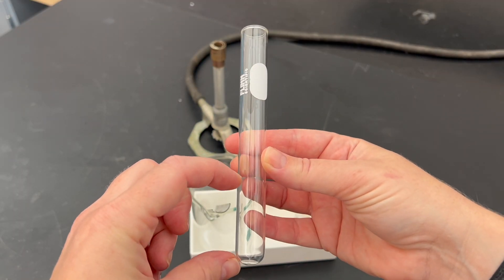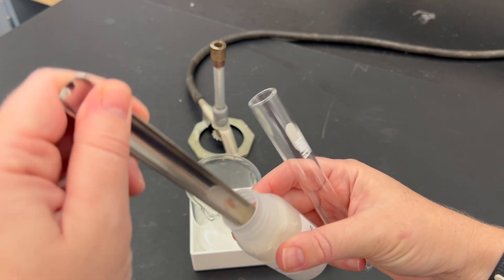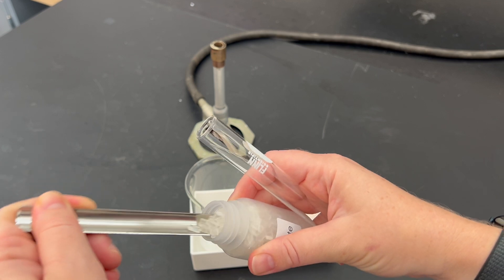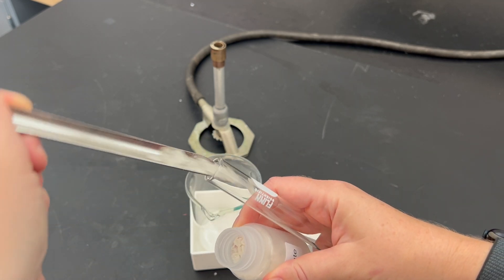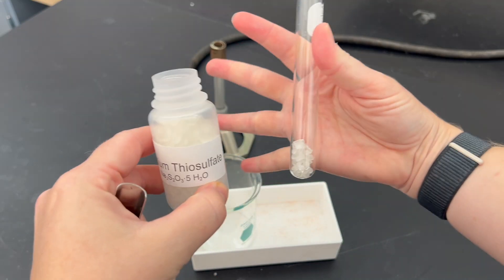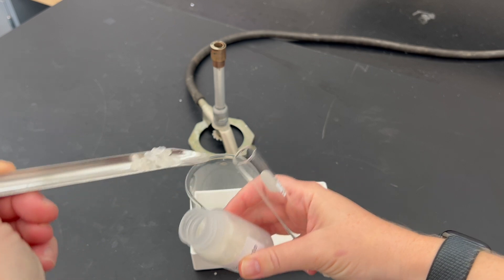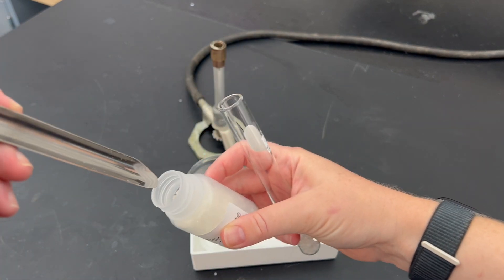You'll first need to start by filling this one quarter of the way full. Open up the sodium thiosulfate and scoop it in. If you spill it on the table, make sure you pick it up. That's not quite enough, a little bit more, a little bit more.